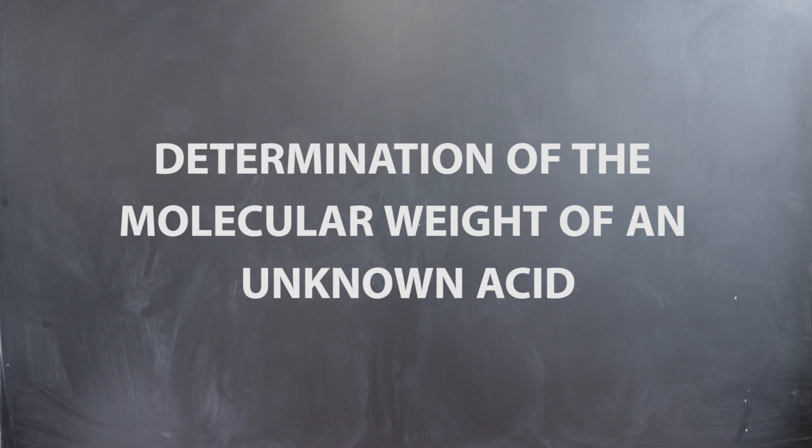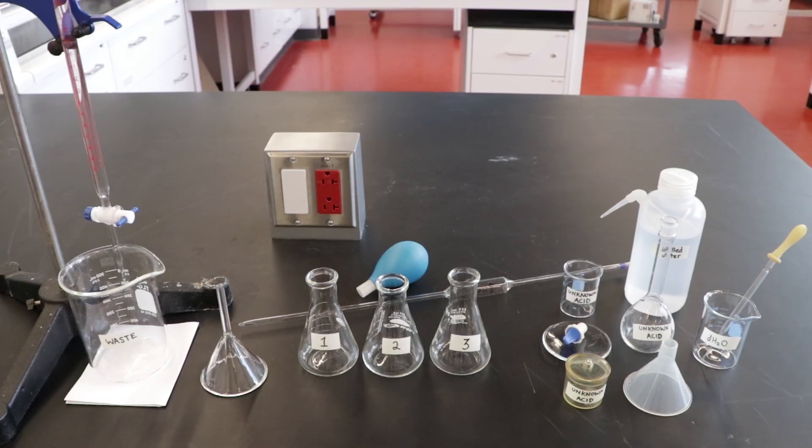Determination of the molecular weight of an unknown acid. This is the apparatus we will be using for this lab.